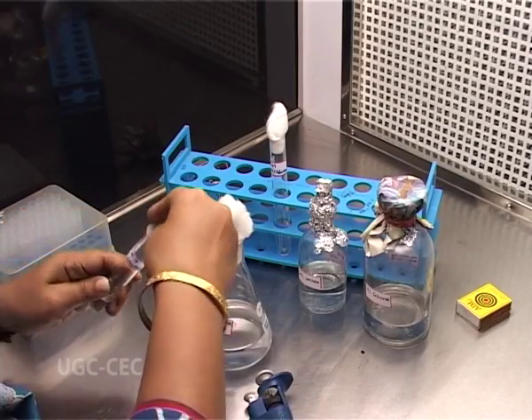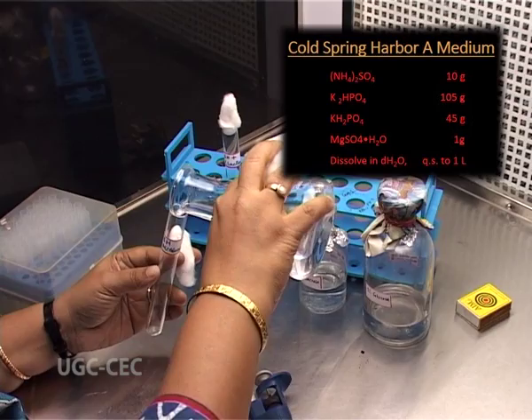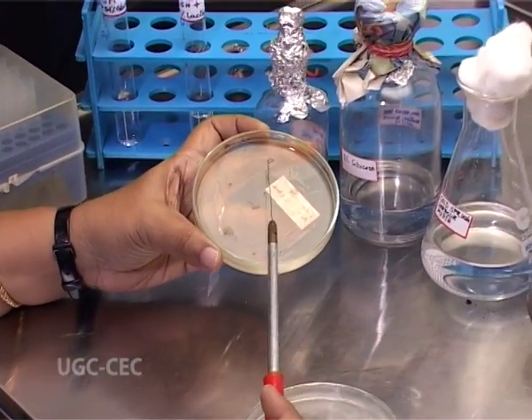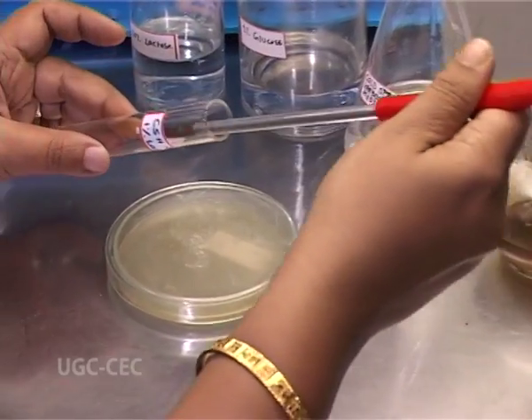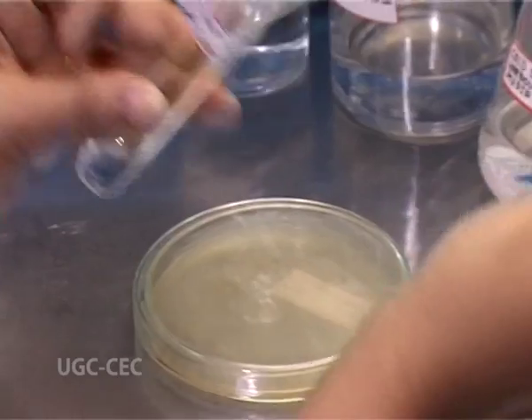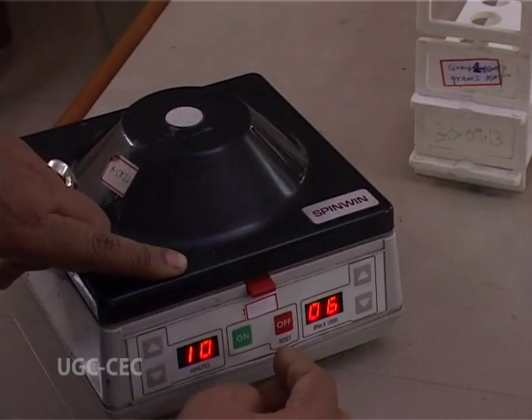To execute a quantitative estimation, first the cells should be grown in Cold Spring Harbor media containing either 0.1% glucose, and the second one where we have inoculated it with Cold Spring Harbor media plus 1% of lactose. In the previous one, there will be no expression of beta-galactosidase, as this media contains only glucose, and the second one contains lactose. After overnight growth, cultures are taken and they are centrifuged.